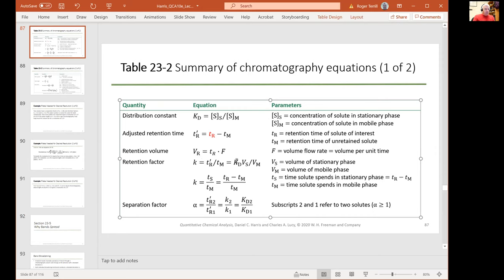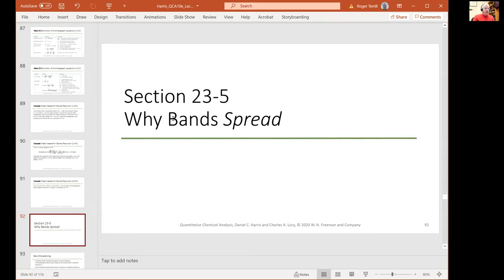But basically there's an equilibrium constant, KD. There's an equilibrium relation that a given molecule has with a given column and stationary phase, right? And that KD value is what determines the retention time, right? So like you say, size or whatever. This is all about what is KD, right? However, where we have moved from there is from what determines KD to the question, why aren't all KD identical?